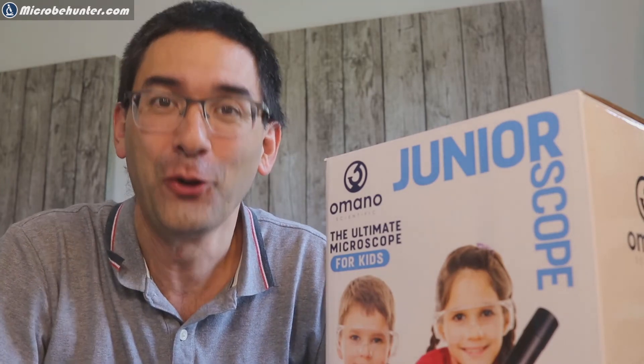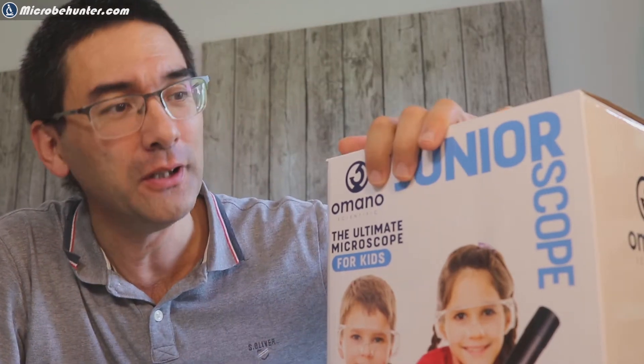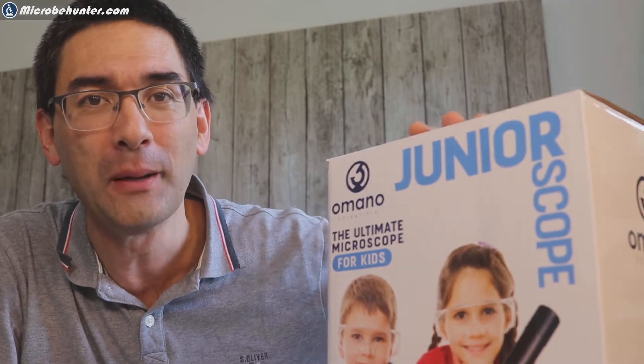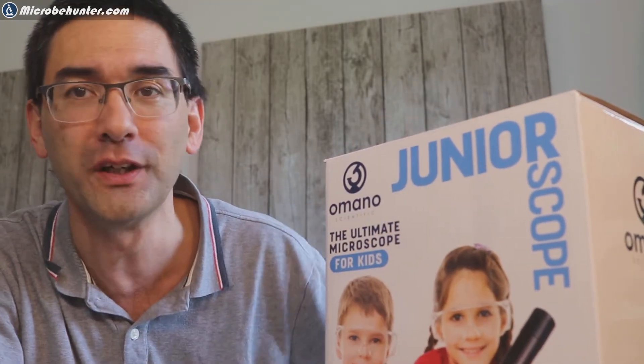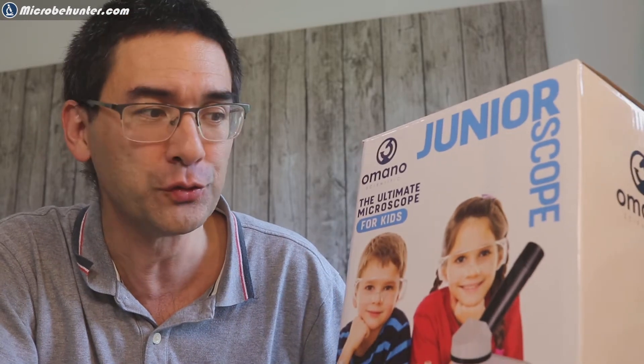Hi, Microbe Hunter here again, Oliver that is. Look what I've got here. Another low-cost microscope. This one is, as the name already implies, it's for children. And I want to do another product review here.